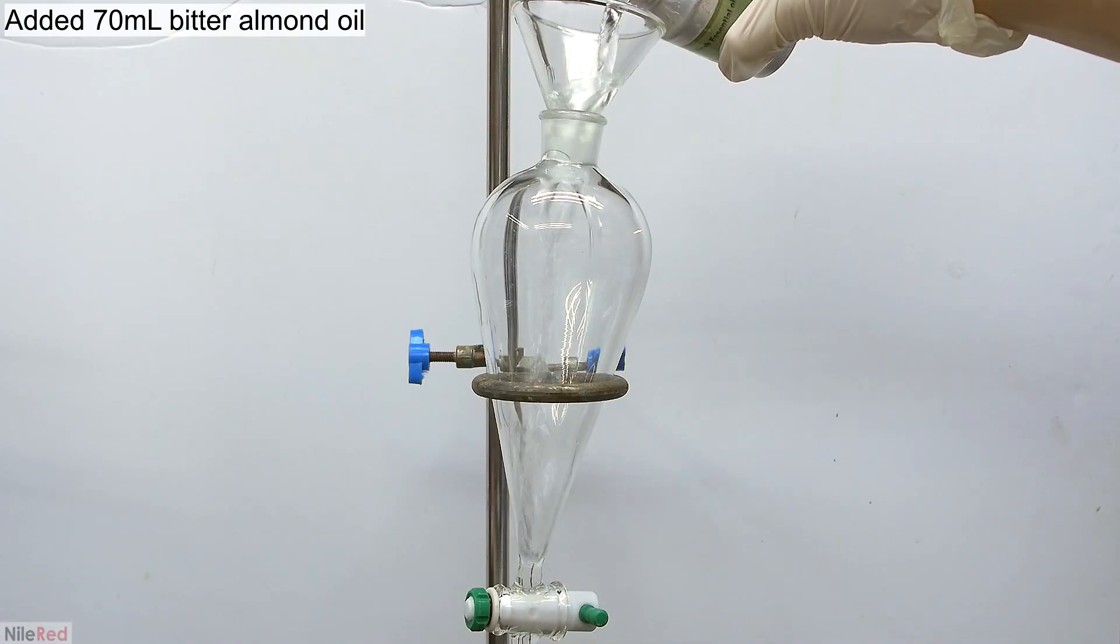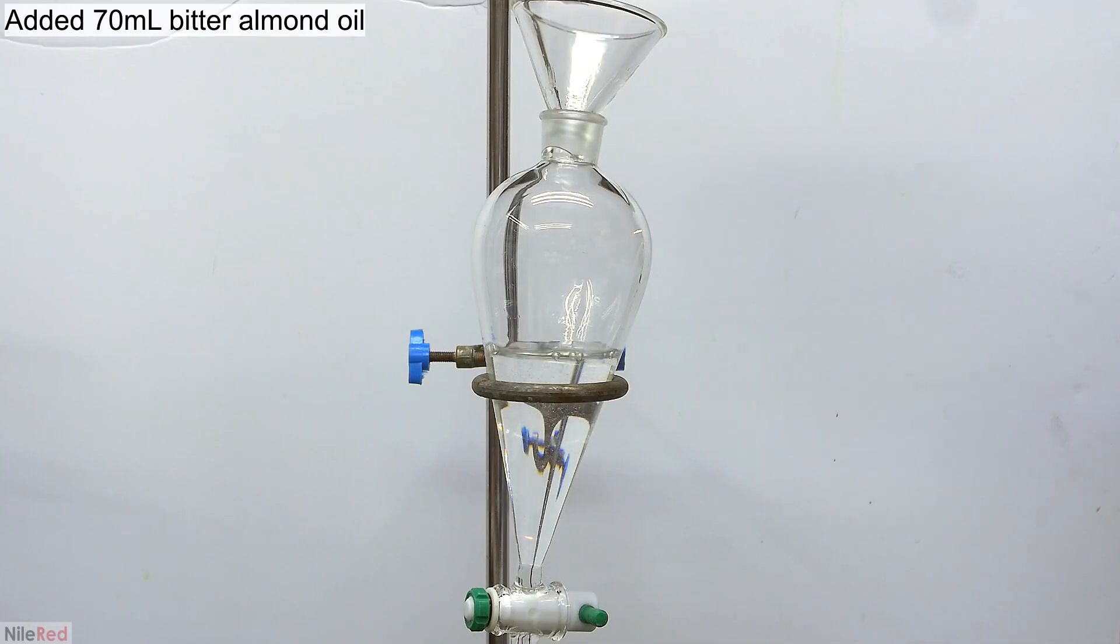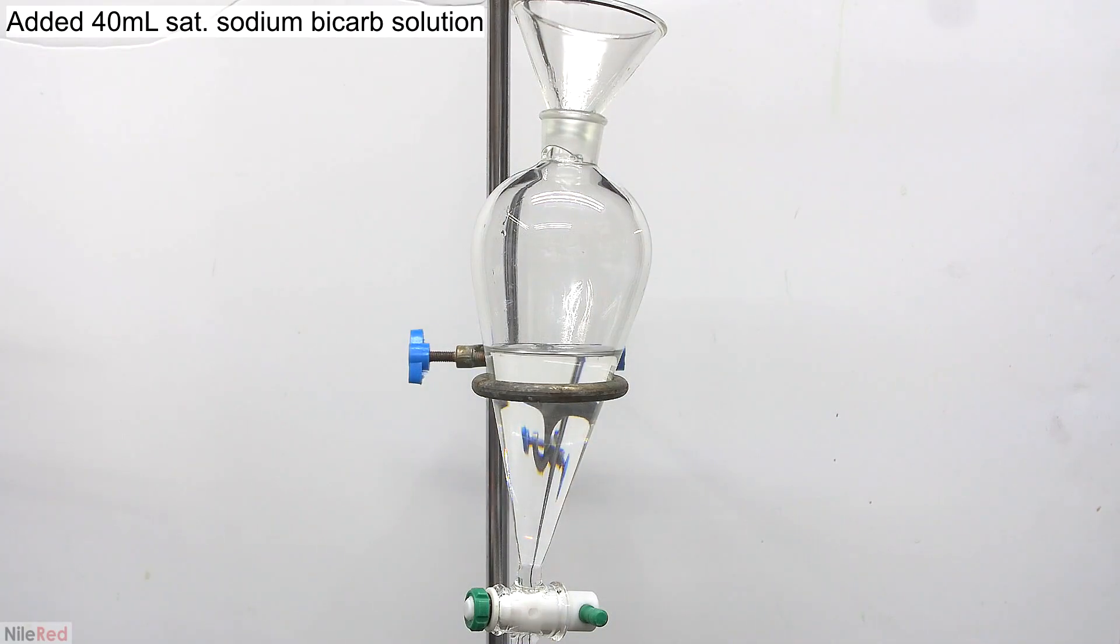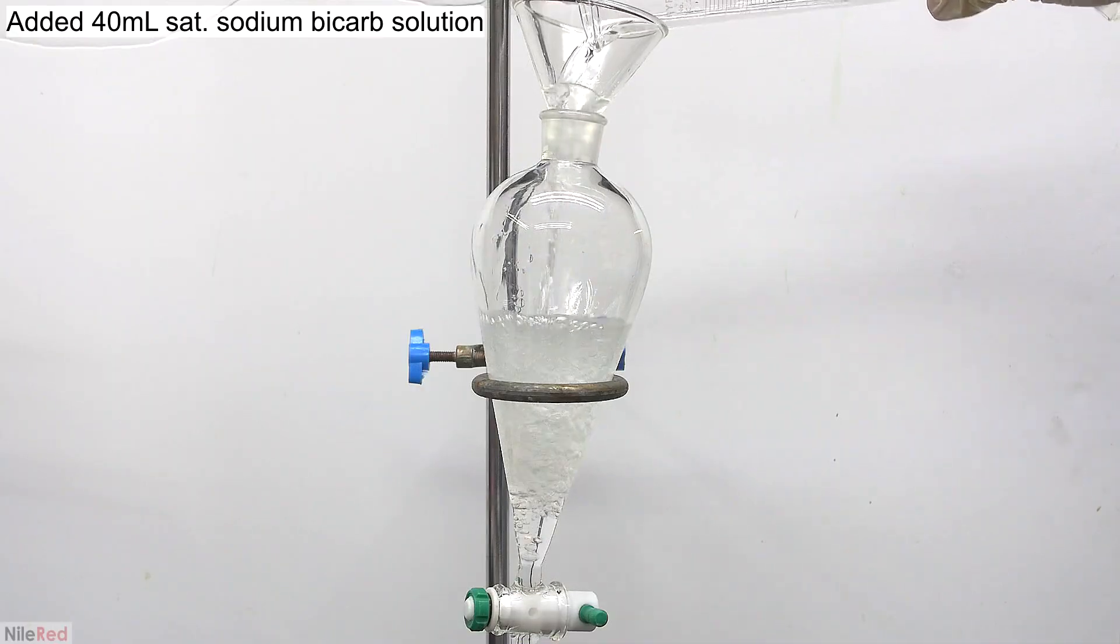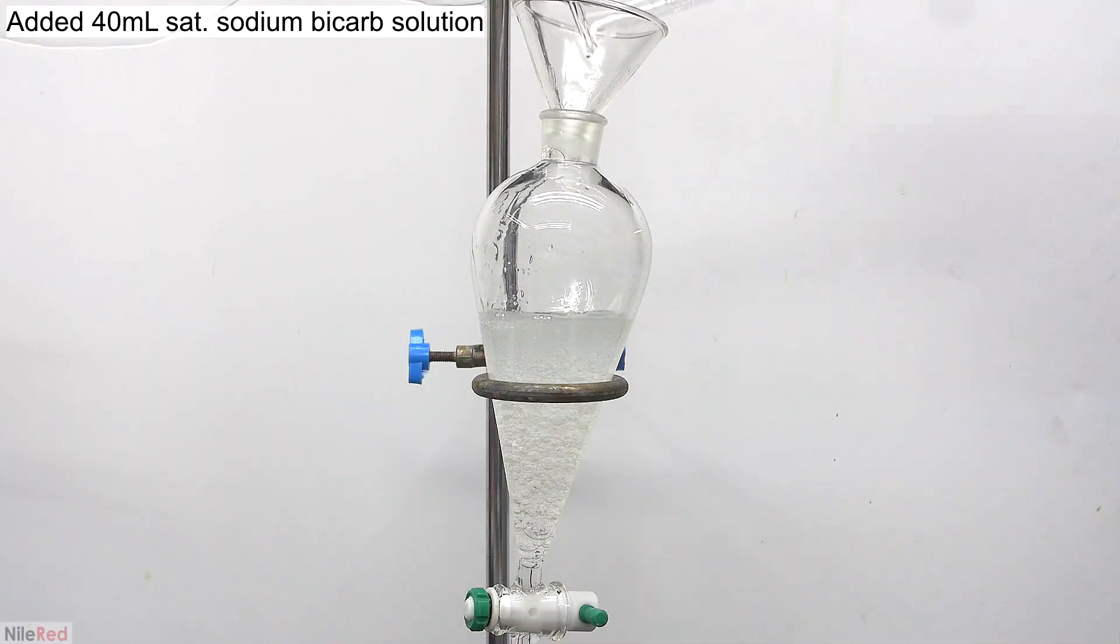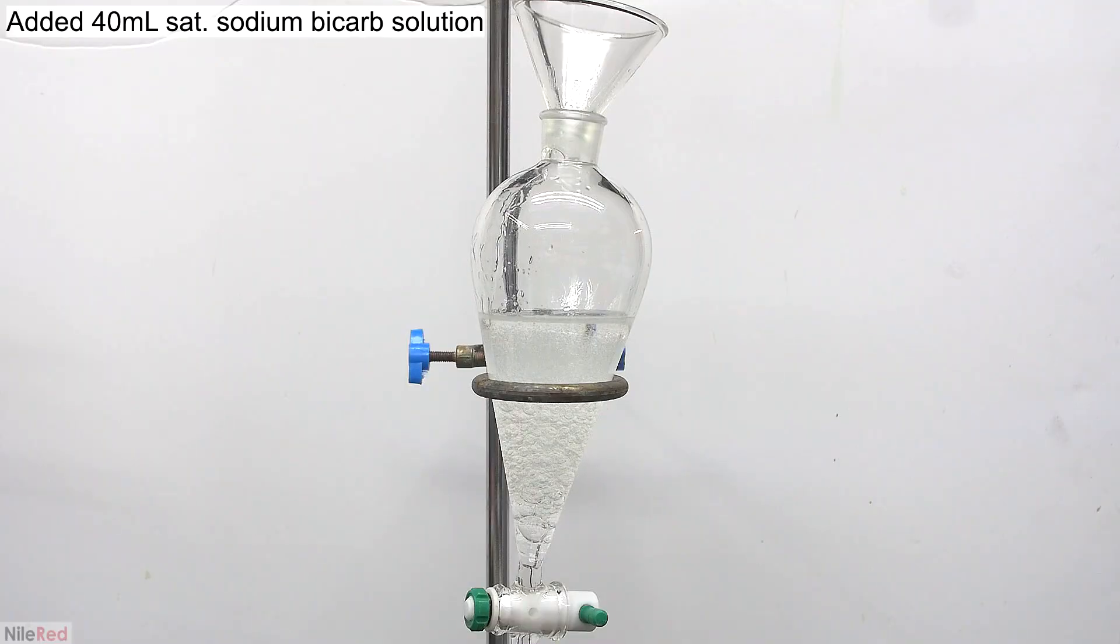To start things off, I add the bitter almond oil to a separatory funnel. I then added in about 40 milliliters of saturated sodium bicarbonate solution. Water and benzaldehyde don't really mix together, and they stay separated as two distinct layers.